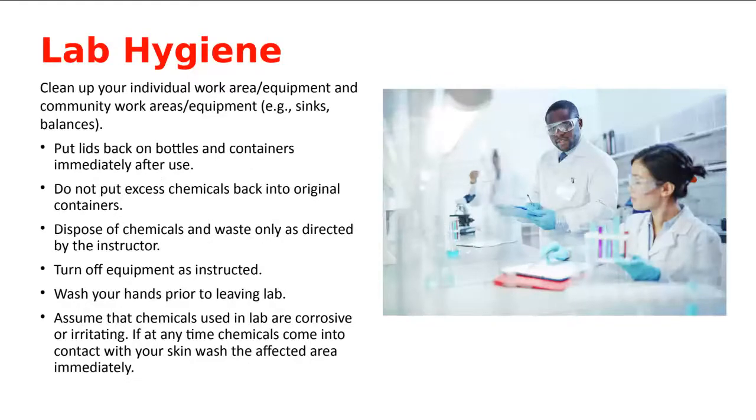Lab hygiene. So we're going to be working with diluents and we're going to be working with chemicals and powders, right? So anytime you use them, be sure that you put the lid back on them, right? That's for lots of reasons. Number one, people won't pick them up out of the lid and drop them. Somebody might not get contaminated with them. And if we're working with an irritant, then you want to be sure that that irritant's not going to affect somebody who's working next to you.